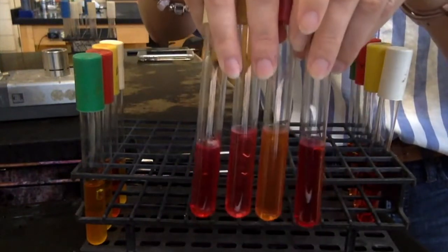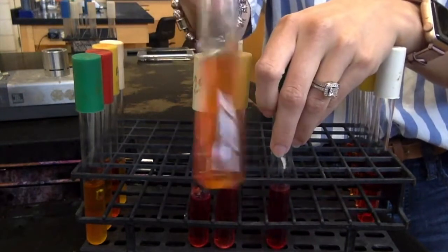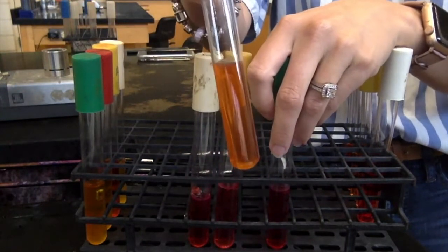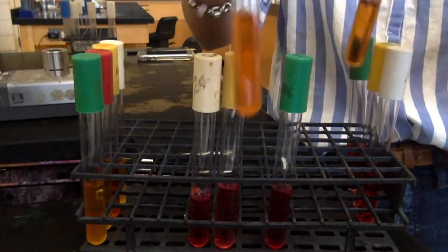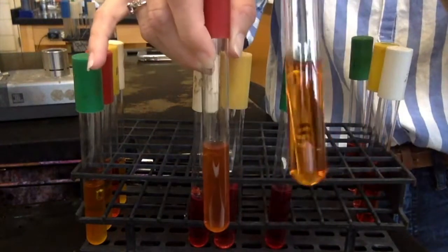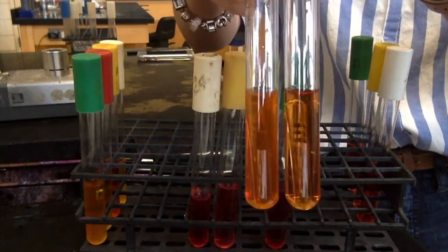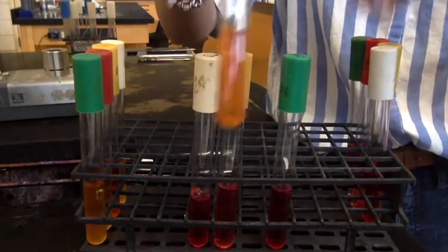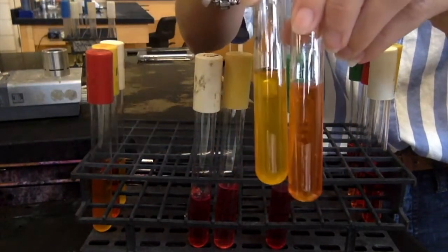So all my tubes are red. Now, the glucose tube looks a little orange. Okay, that's because the glucose tube starts out as orange. Okay, so if you look at the glucose tube here, this one hasn't been inoculated at all. And look how close it is to the original color. So that's a negative result. And if you look at a positive tube, you can clearly tell this is yellow.